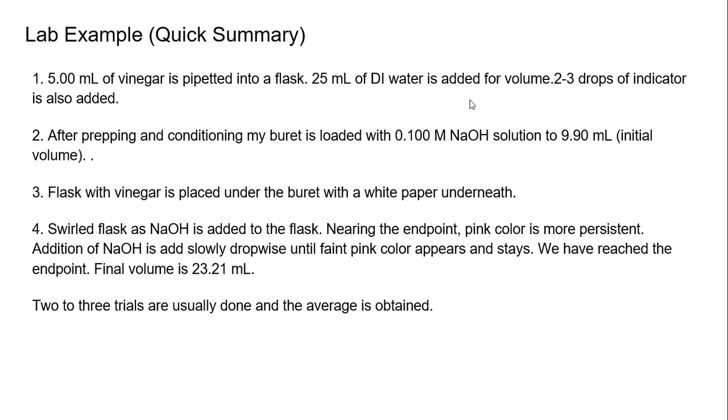After prepping and conditioning your burette, which you will watch in the videos, you are then going to load your base into the burette. I'm going to say I started with my initial volume at 9.90 mL. The burette is in mLs. Then I'm going to have my flask with vinegar, that is the 5 mLs of vinegar, underneath the burette on the counter, and I'm going to place a white piece of paper underneath so I can see, because a black countertop doesn't allow you to see the color change very well.